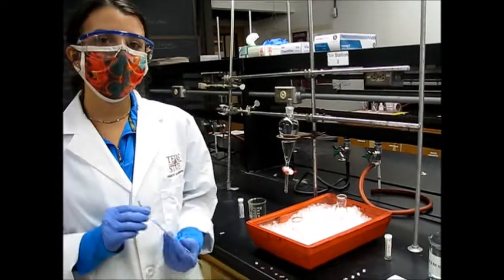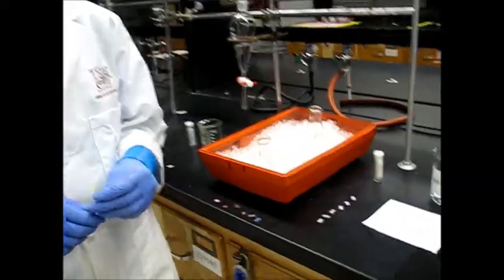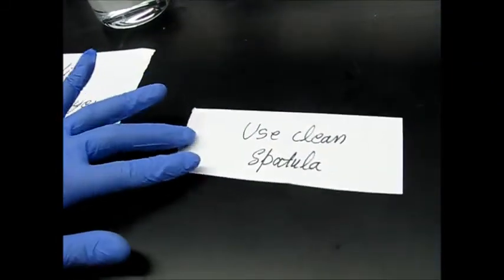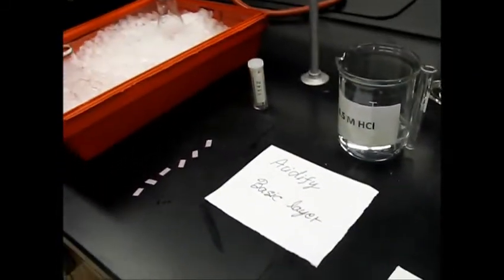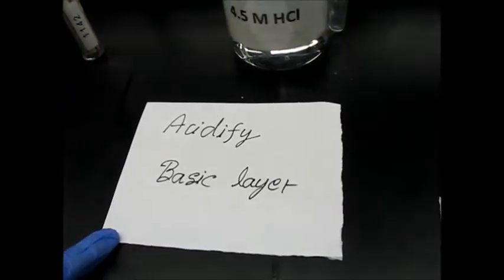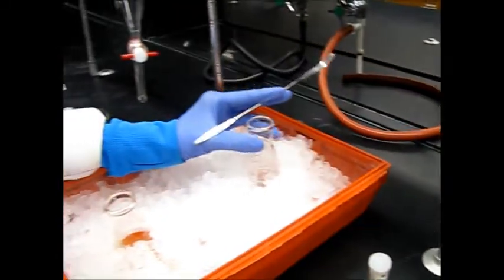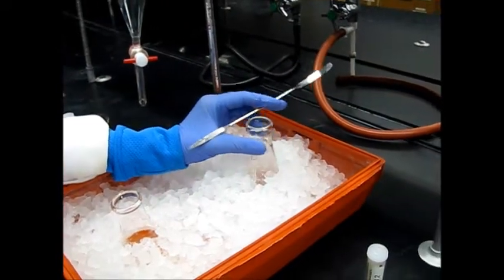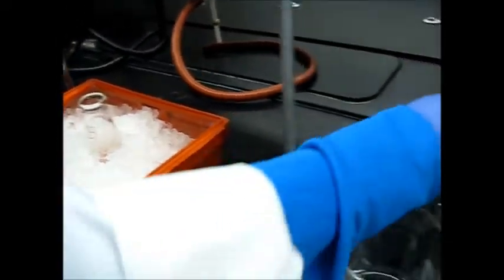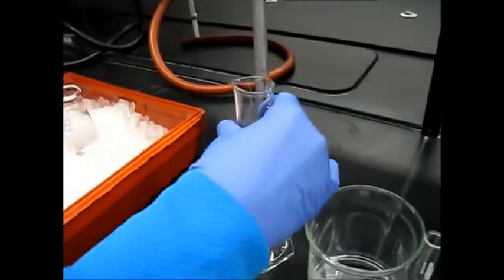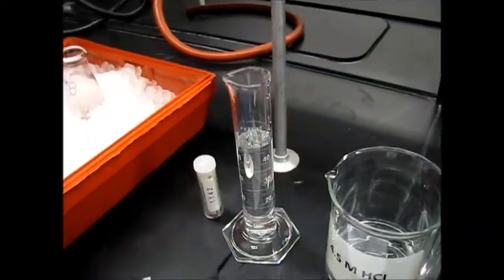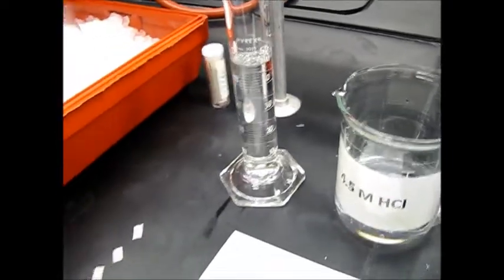Make sure that you always clean the spatula between compounds because you don't want to contaminate your other solutions. Now we will move on to acidify the basic layer. Our basic layer is labeled B here in the back of the ice tray. I have weighed out approximately 45 to 50 milliliters of 4.5 molar HCl and I have cut up a litmus paper so I can test it along the way.